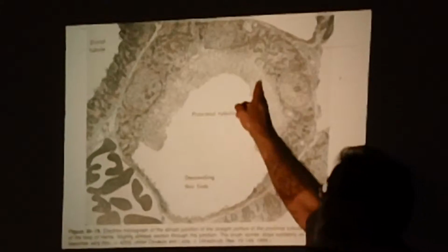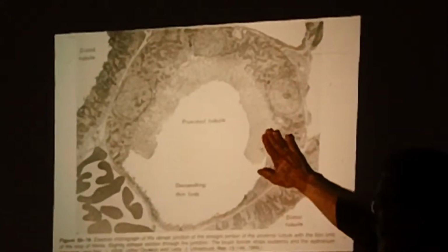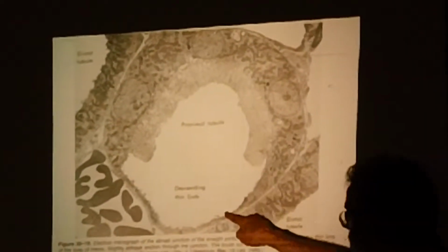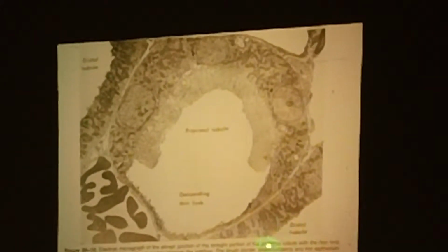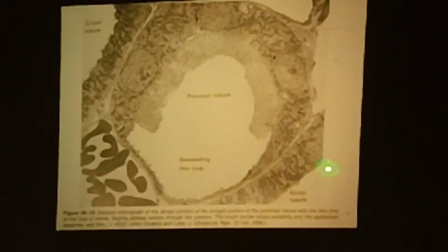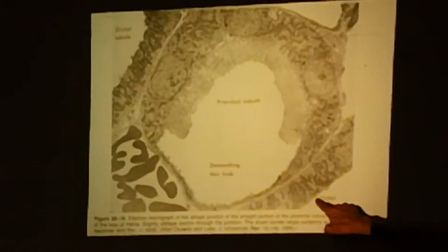Here you can see the brush border or the microvilli of the proximal tubule straight portion. And here you can see the simple squamous. Over here, well actually, here and here, you've got distal tubules. And note, clearly that luminal profile is a lot cleaner than this one because all we've got in the way of microvilli are these little stubby protuberances.